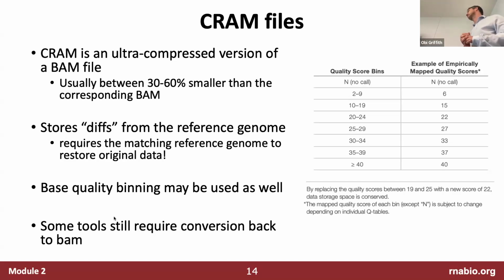The trick is to make them so that you very clearly indicate in the header records what the reference file is, and make it available somewhere or keep it handy. We've had problems where we download data from dbGaP and can't correctly reproduce the BAM file from the CRAM file because we can't find the right reference.